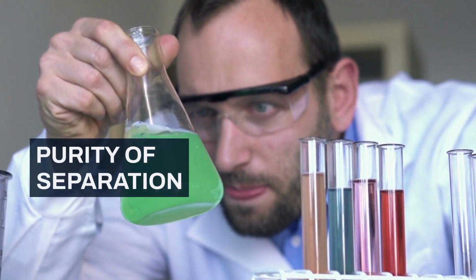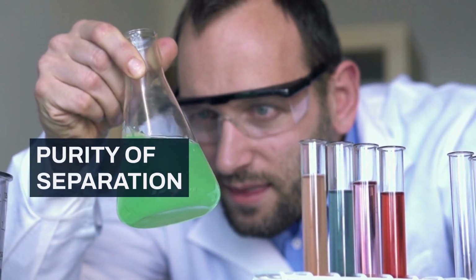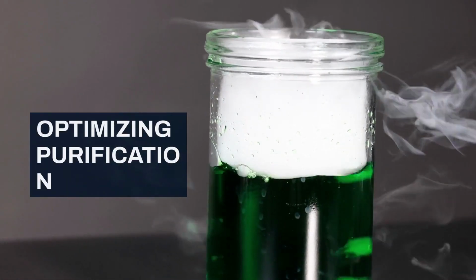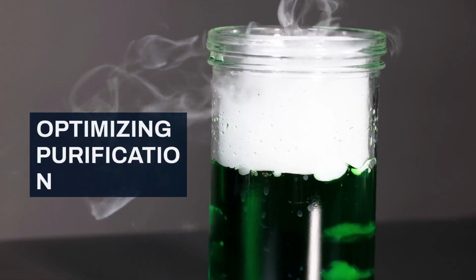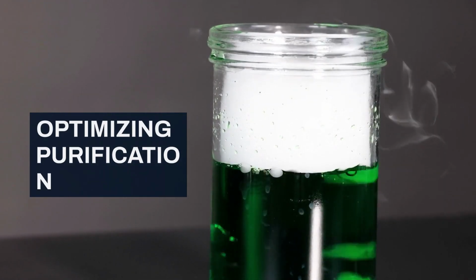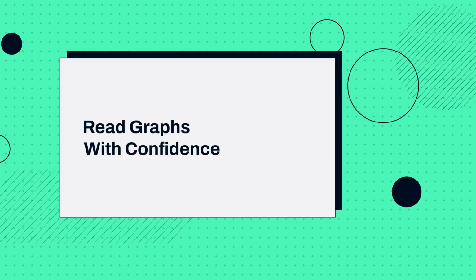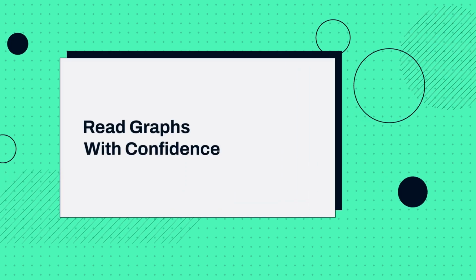Overlapping peaks suggest that your components are not fully separated. By looking at the salt gradient line, you can determine the specific conditions needed to elute each component. This information is vital for optimizing your purification process. We hope this simple explanation helps you read these graphs with confidence.